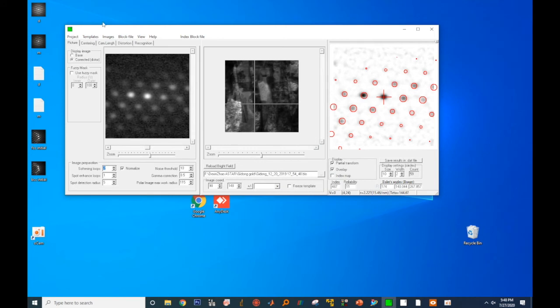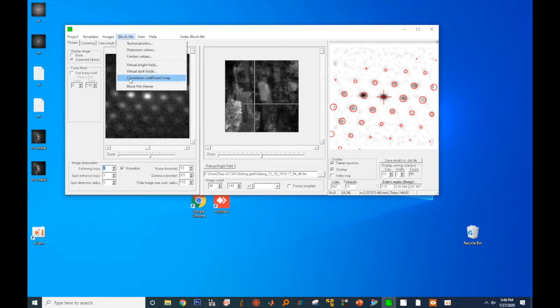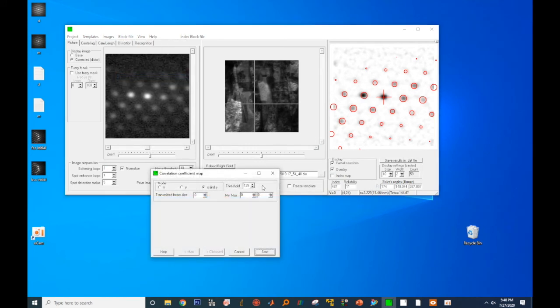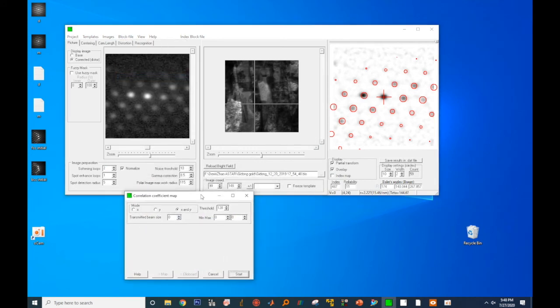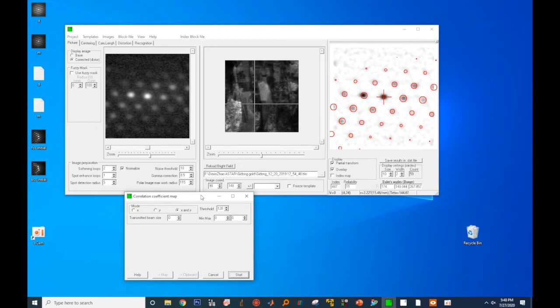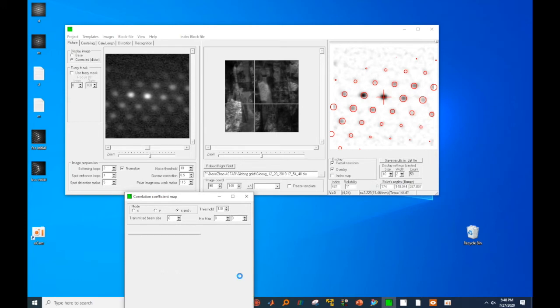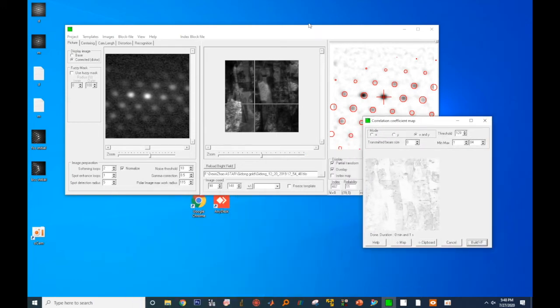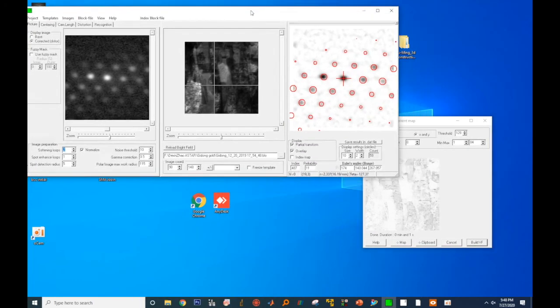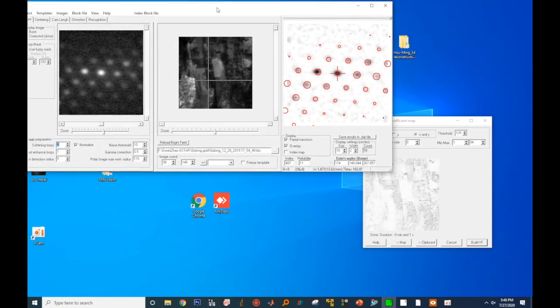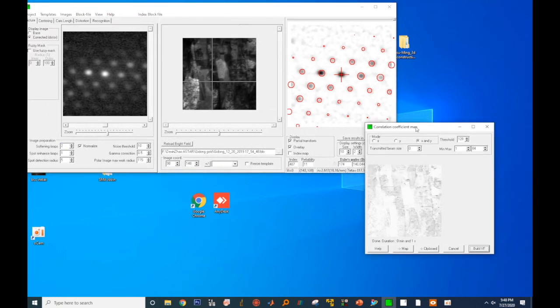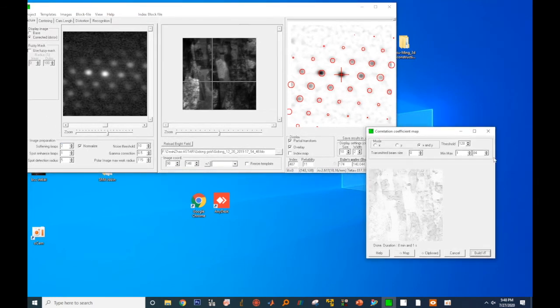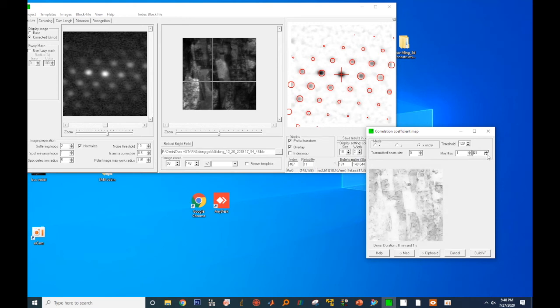Go to the block file tab, select the correlation coefficient map. The current selected mode is X and Y. I'll talk about it later. Then click on start. It will generate the correlation coefficient map. What the correlation coefficient map does is it compares the diffraction pattern of a pixel to its neighboring pixels.